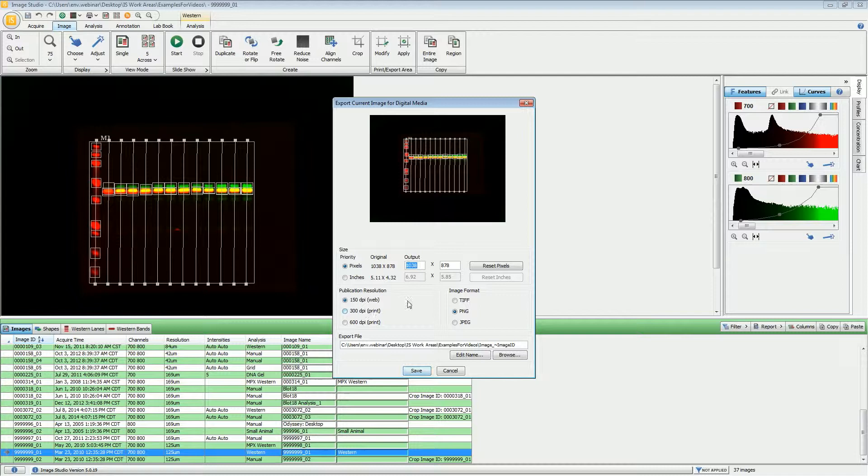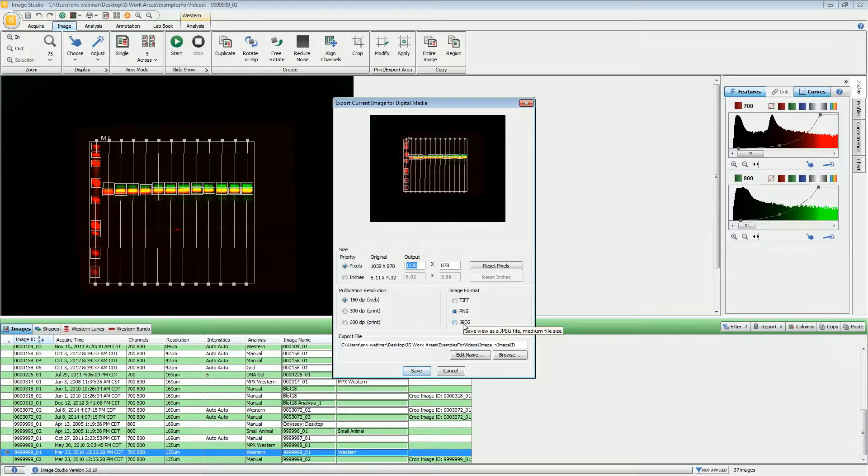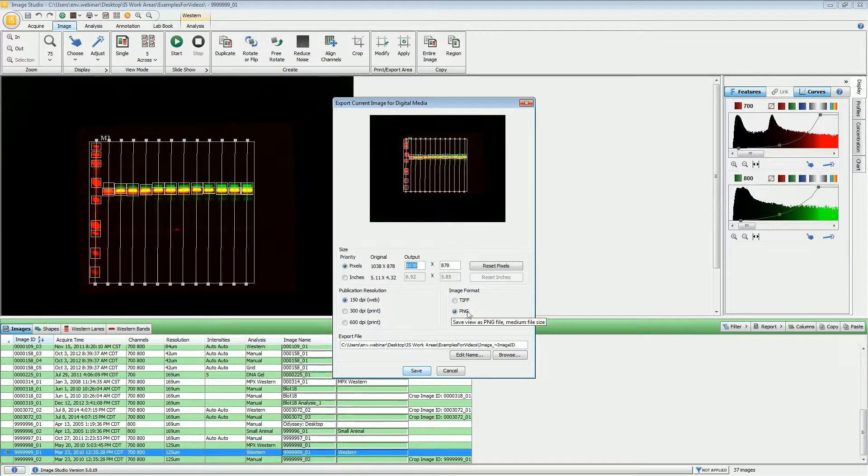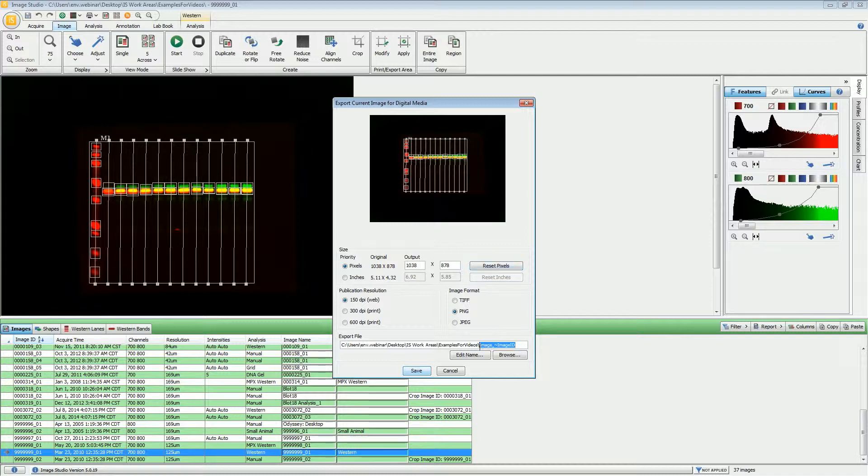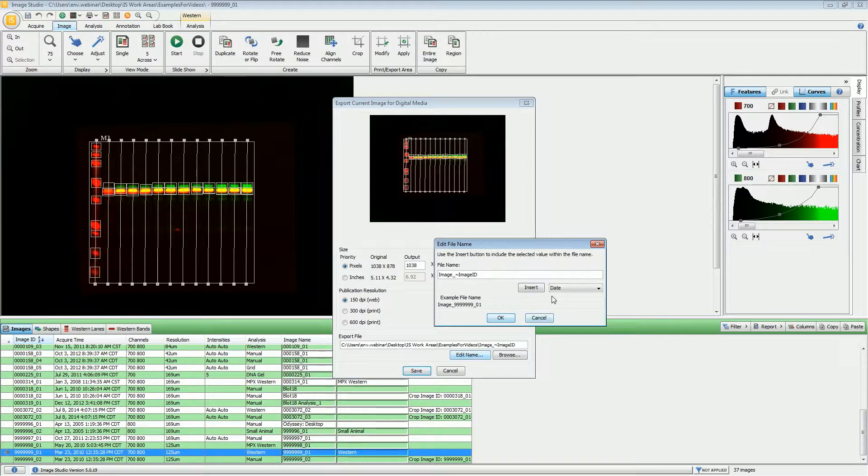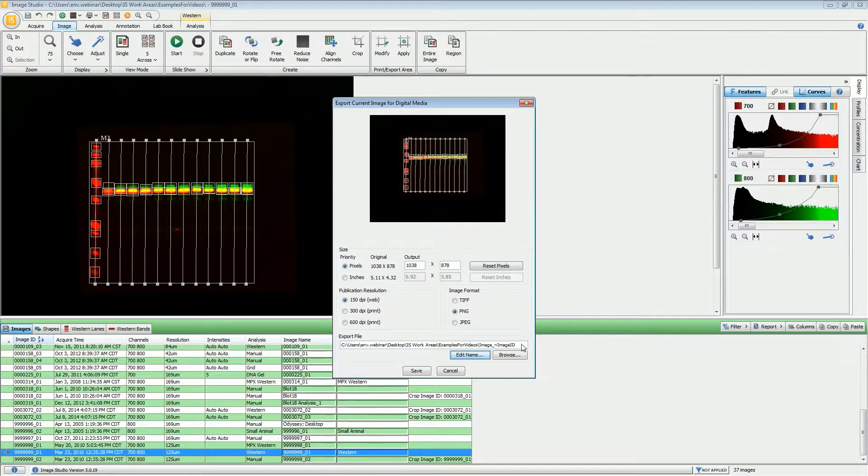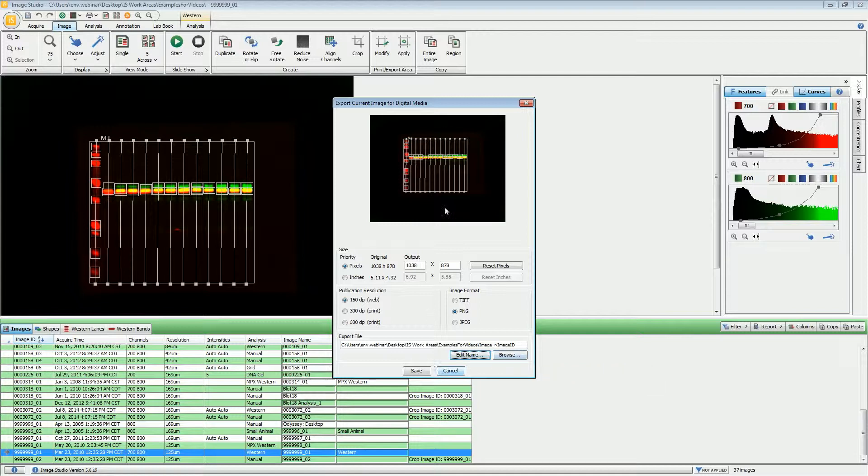Most of the time for digital presentation, a PNG file will work perfectly fine. You also have the option of JPEGs and TIFFs, but 150 DPI and a PNG file are the default settings for digital media. Under the name, you can type in whatever name you want. If you click Edit Name, you can insert different fields if you want a different default setting. You can also browse to wherever you would like the file to be saved.